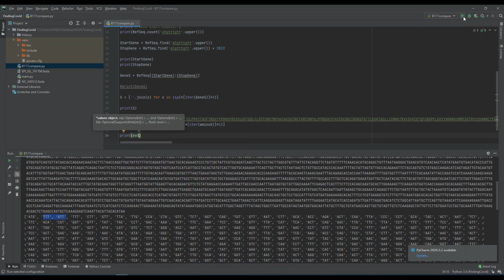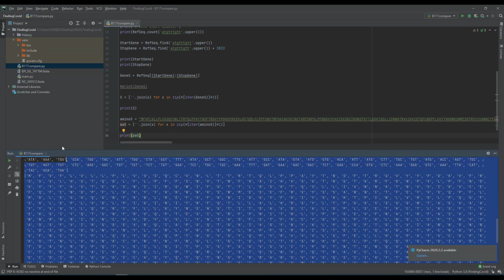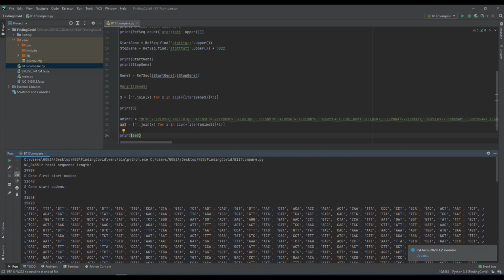I just noticed that. Okay, hilarious. And there we go. So we have an amino acid library that's going to line up over our genes, or not genes, our amino acid base pairs, and we'll get a better understanding with this.